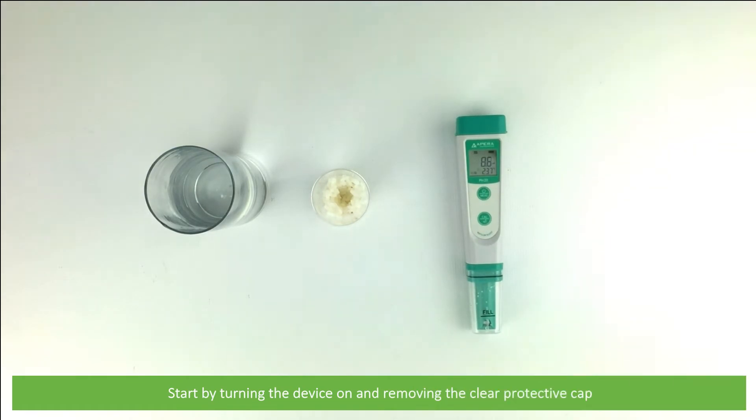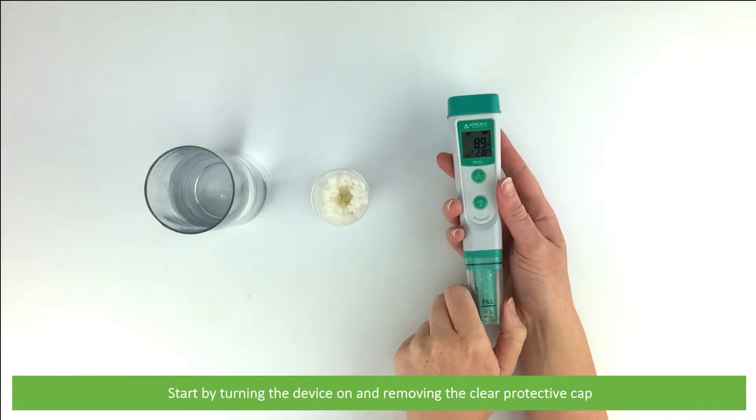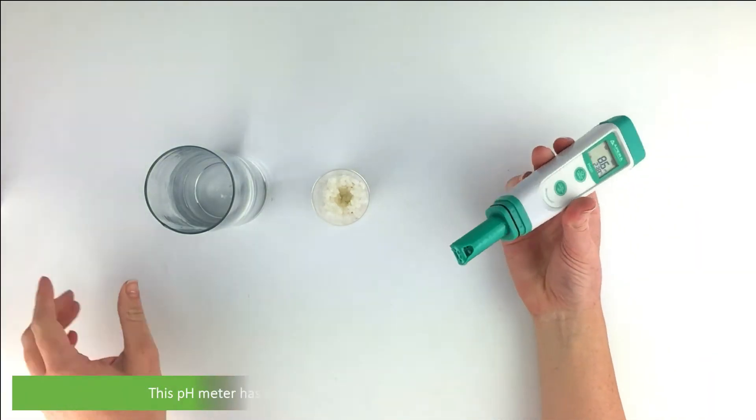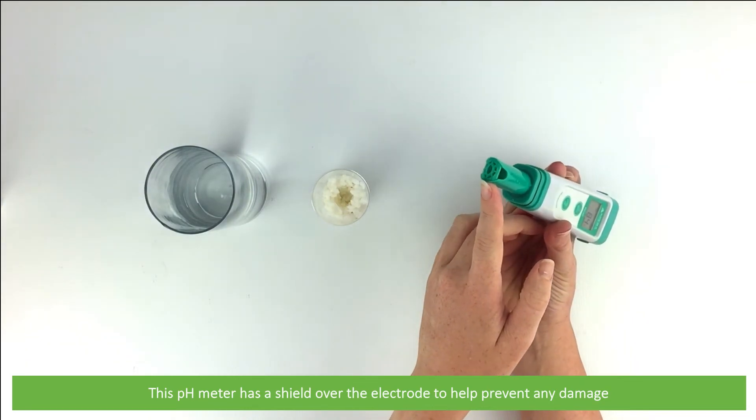Start by turning the device on and removing the clear protective cap. This pH meter has a shield over the electrode to help prevent any damage.